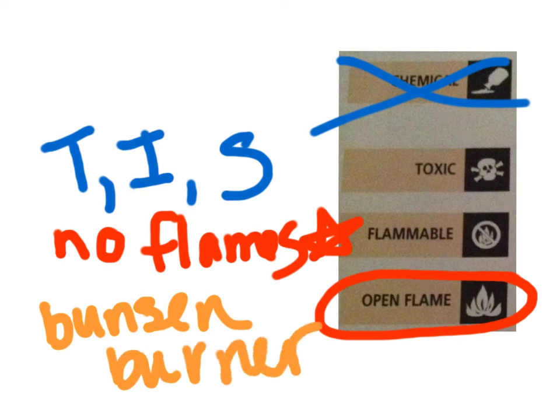Okay, and then our last couple, the first one, you're going to see this all the time. It is dealing with eye safety. Wear your goggles all the time. That's what the symbol means. Okay, you see the pair of goggles? You got to put them on. Next, we have clothing protection. And it's the picture of the apron. And this symbol appears when substances could stain or burn clothing. So, when you see the picture of the apron, that means put one on.